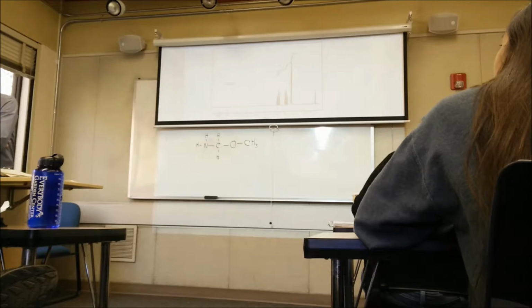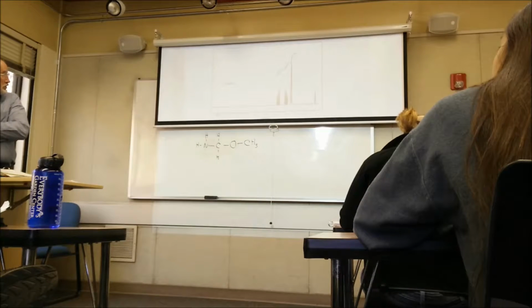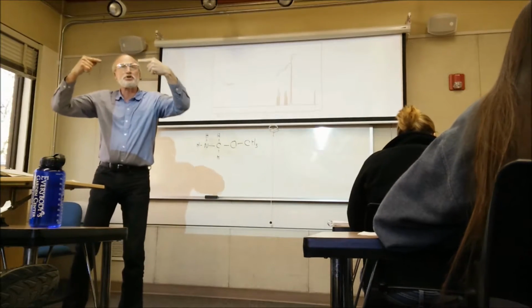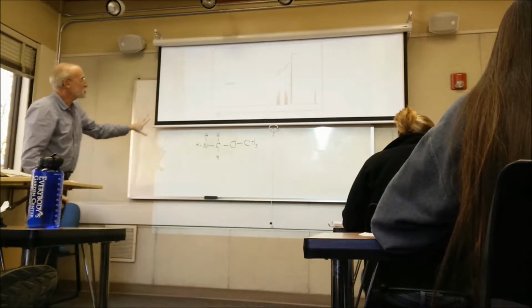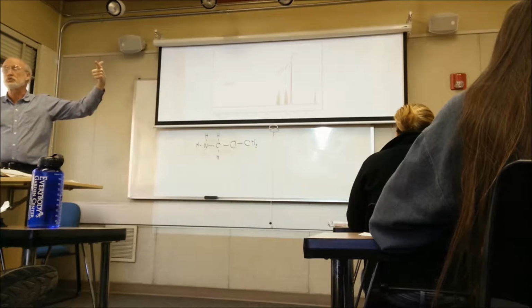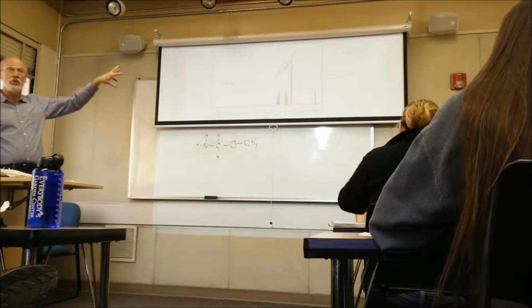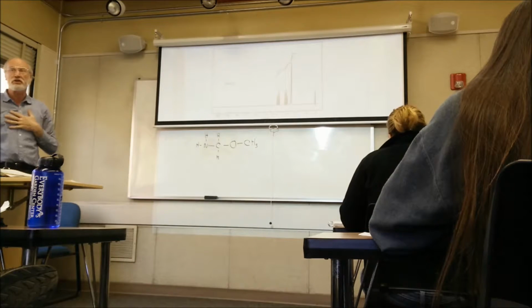Yeah, it comes out with a different spectrum. You can't have those, you won't end up with those triplets and quartets and all that. That's correct. Okay, so there is not a series of steps you can follow automatically. What you do is you take a look at this thing, you look at how many groups of carbons you have, you ask how they're split, and then you start fooling around with fragments of the molecule until you come up with one that gives you the spectra you've got.